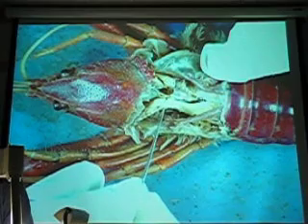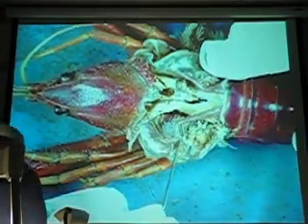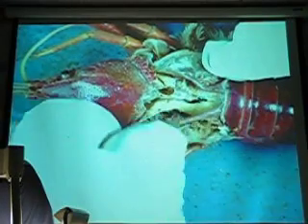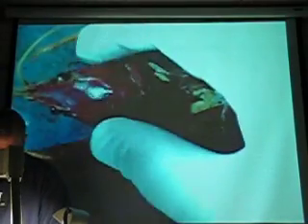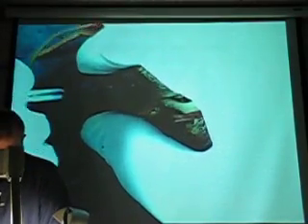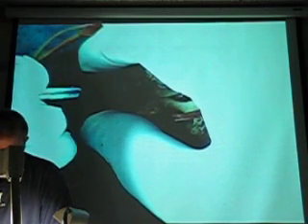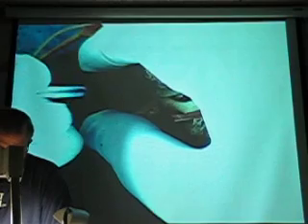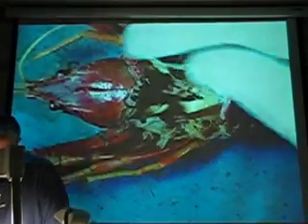What are these things? Digestive gland? All right, let's go with that. It's going to hurt you more — no, it's actually going to hurt you more. Scissors would be better, but I couldn't find any scissors over there. It's so good. I'll help you. Let's go with it. The middle de la pan.